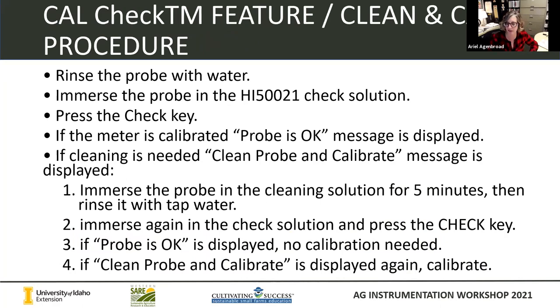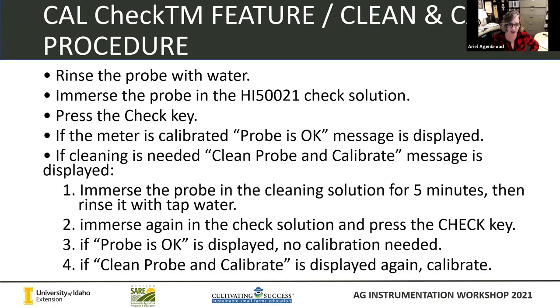The cal check feature means you have to carry around less solution and do fewer steps before you're ready to sample. You rinse the probe with water, immerse the probe in your check solution — and you're all getting several little containers of check solution — then press the check key. If it's calibrated, it's going to give you a 'probe is okay' message. If it needs to be cleaned, it might give you a 'clean probe and calibrate' message. To clean it, immerse it in cleaning solution for five minutes, rinse it with tap water, put it back in the check solution, and press the check key again. If it gives you that message a second time, you do need to calibrate.